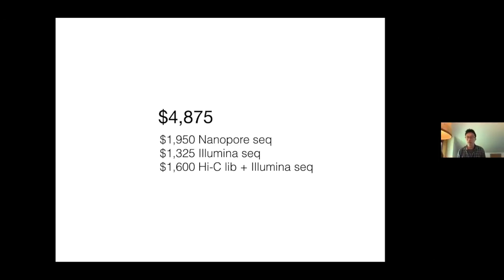Sometimes they work perfectly. Sometimes you need a lot of manual work. The key is it will give you a contact heat map, which basically tells you the contact frequencies based on the read map, the pairs. You can manually move blocks around.